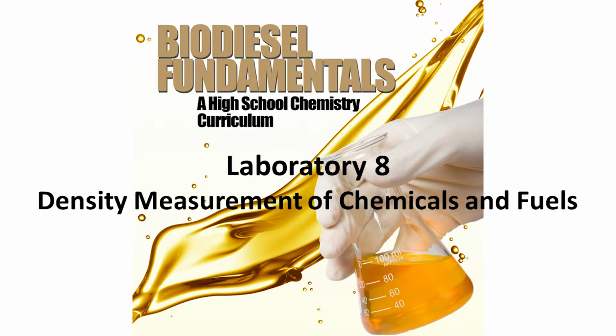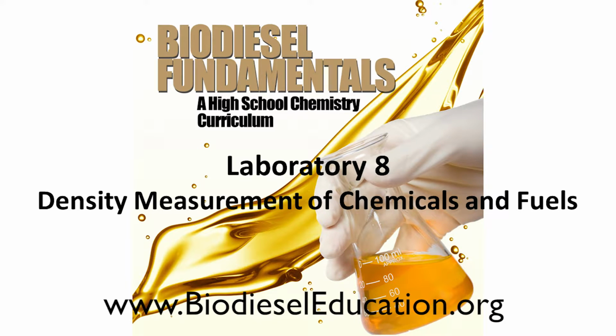This is the 8th in a series of 8 chemistry labs on the fundamentals of biodiesel. In this lab we will learn about Laboratory 8, density measurement of chemicals and fuels. Written procedures and background information for all 8 labs is provided on the Biodiesel Education website.